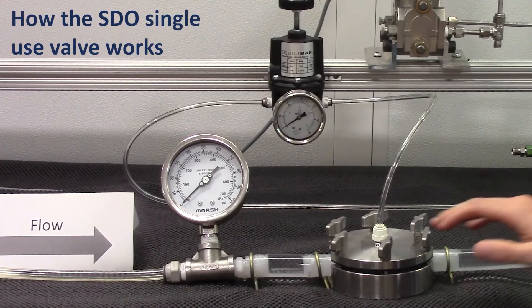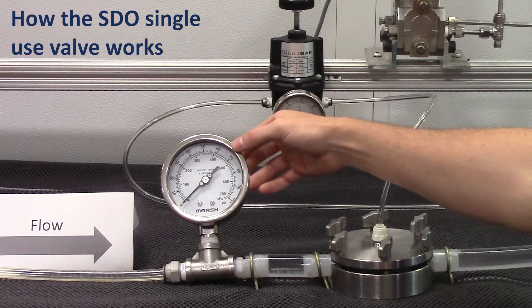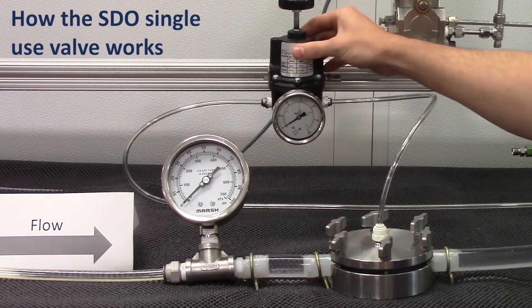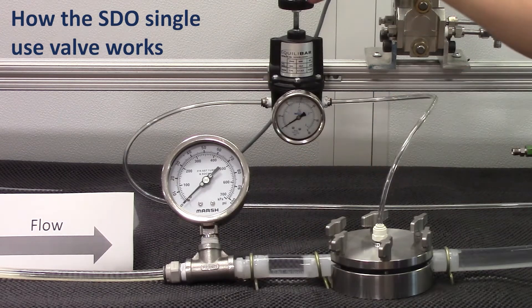Let's look at the stability of the Equilibar single-use valve controlling inlet pressure here from flow left to right. We see our pressure transducer communicating inlet pressure in units of psi. This is the pilot regulator which sets the dome pressure which will, at a one-to-one ratio, control the inlet pressure.